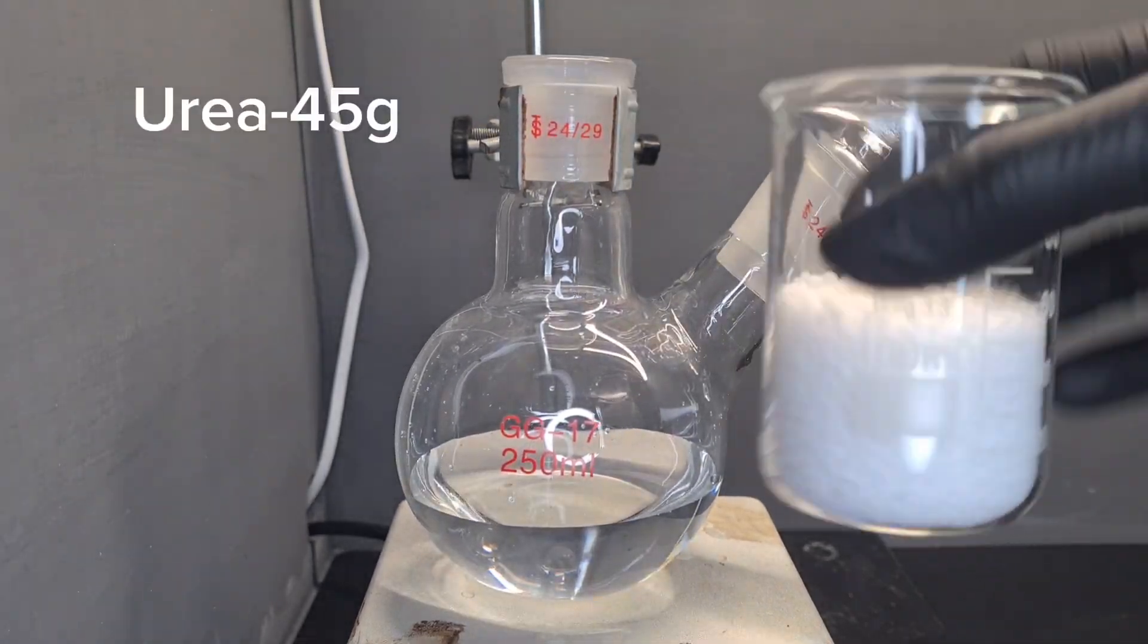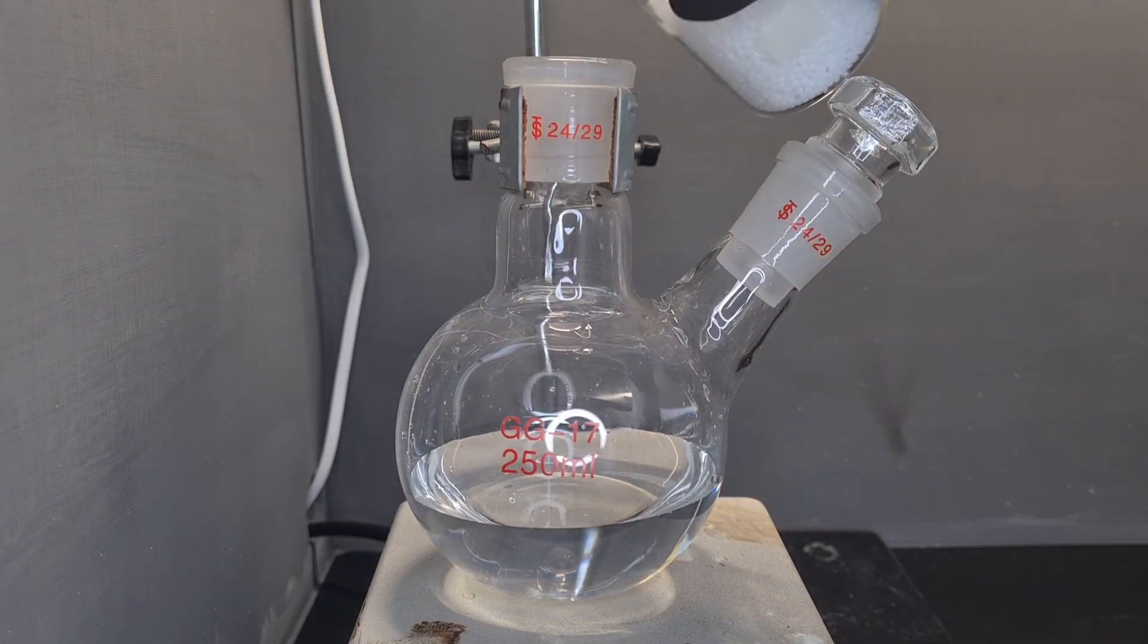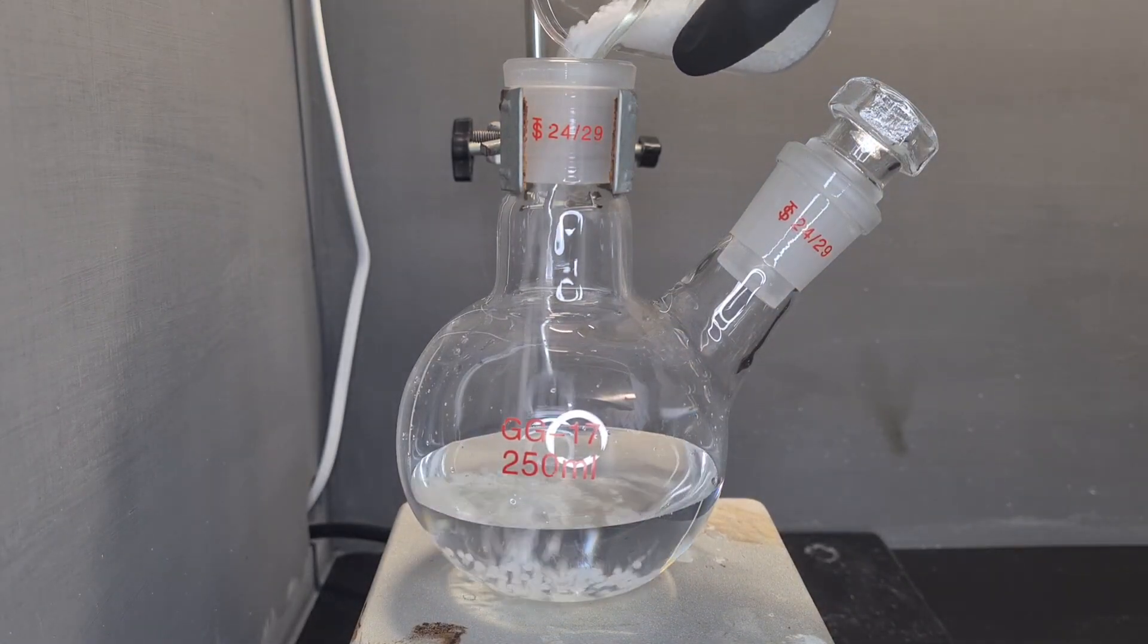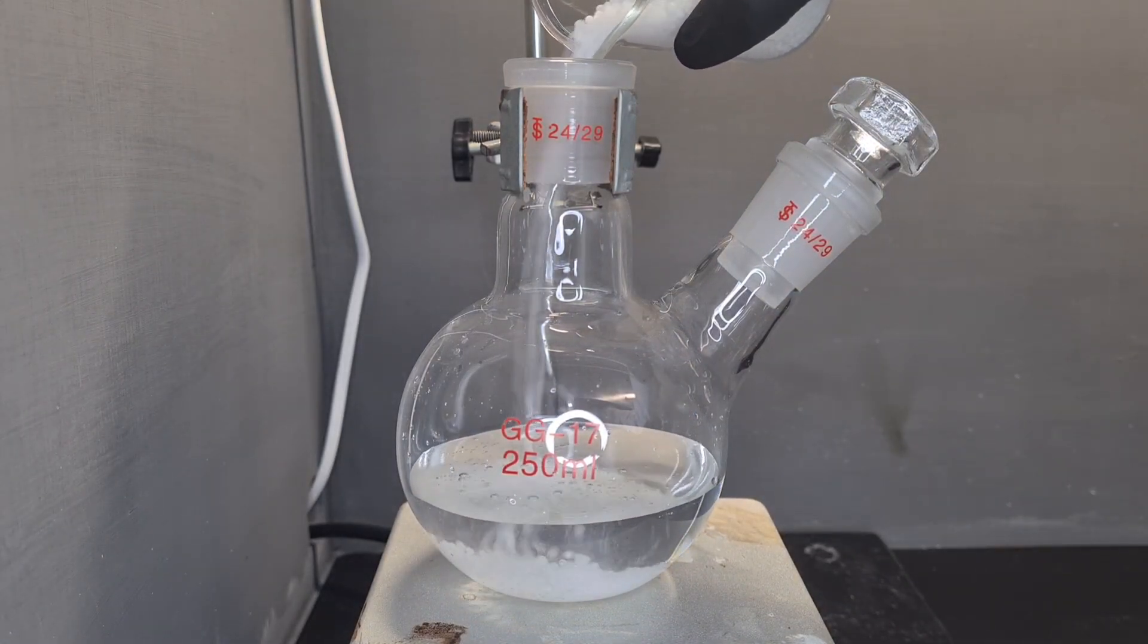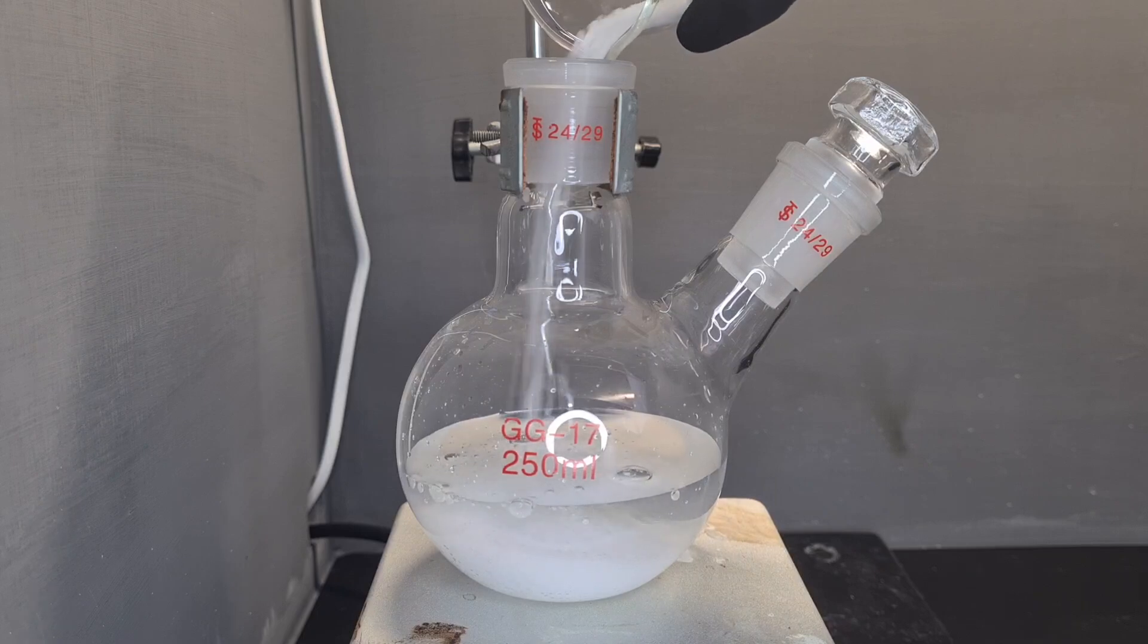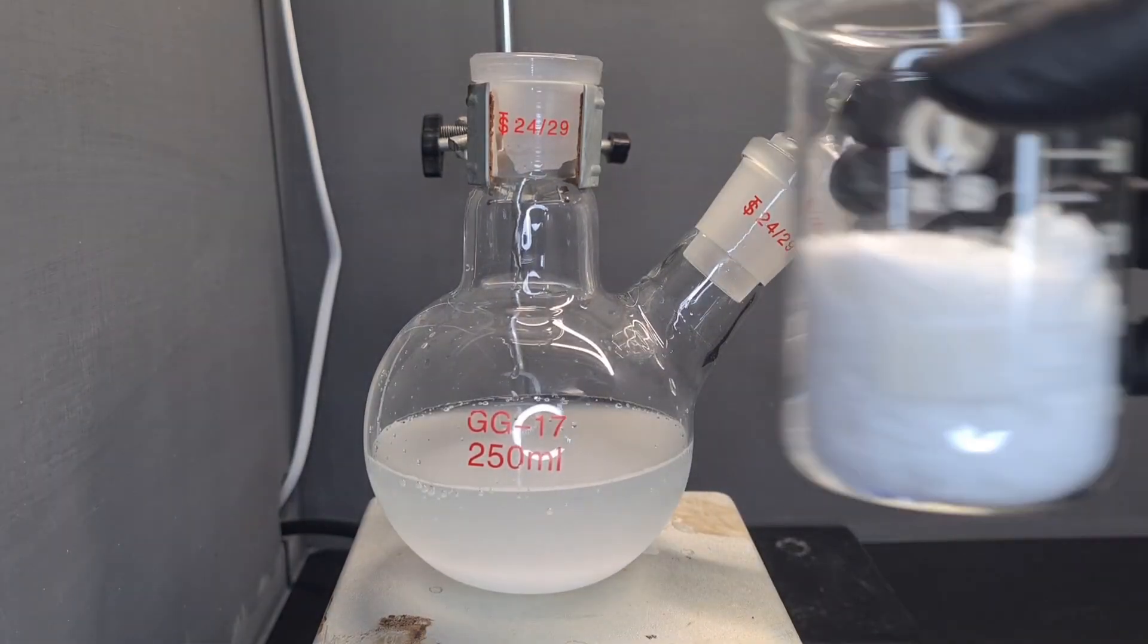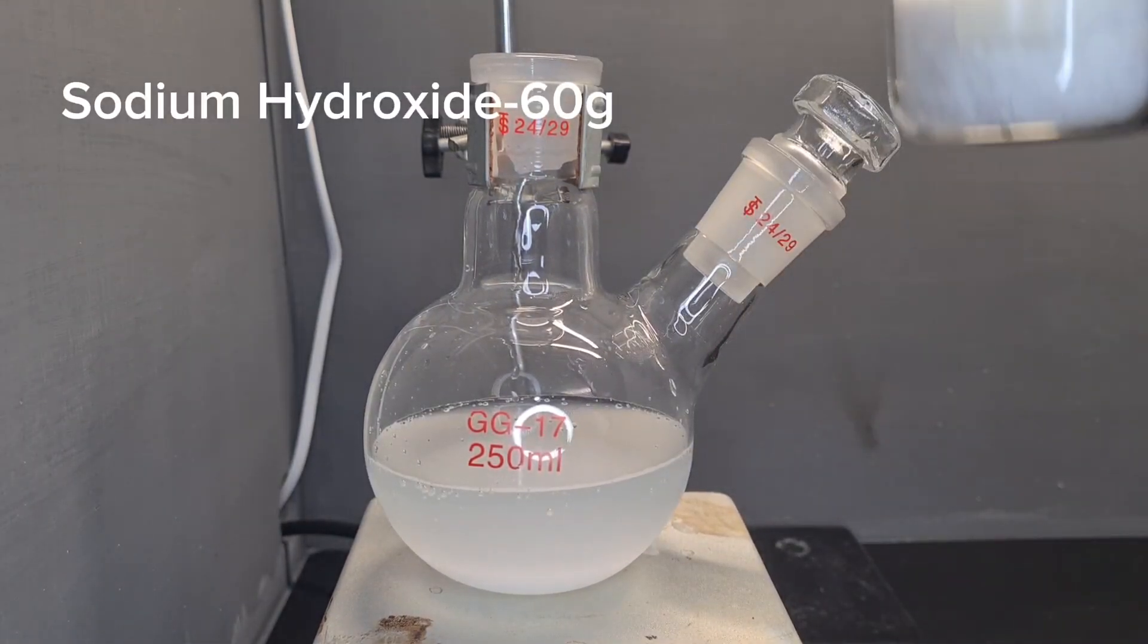Then we're going to add 45 grams of urea. Then I'll add 60 grams of sodium hydroxide.